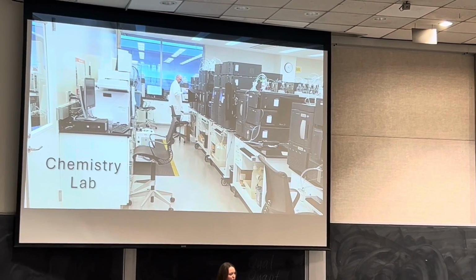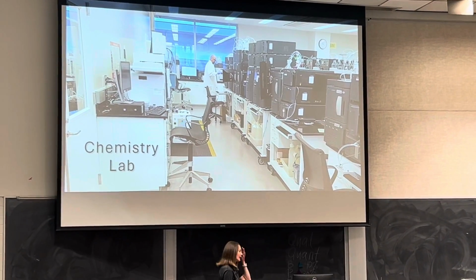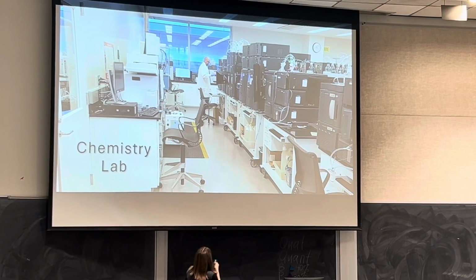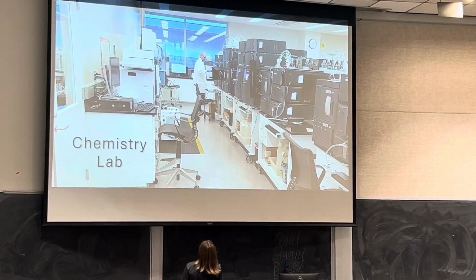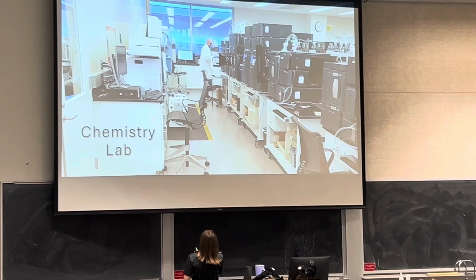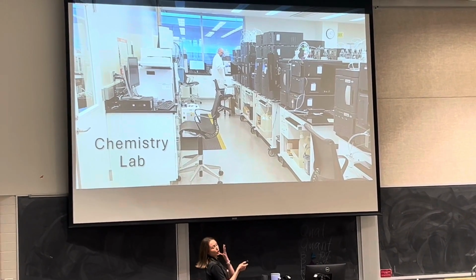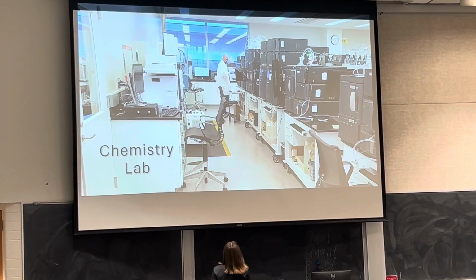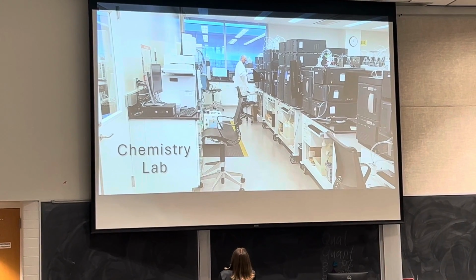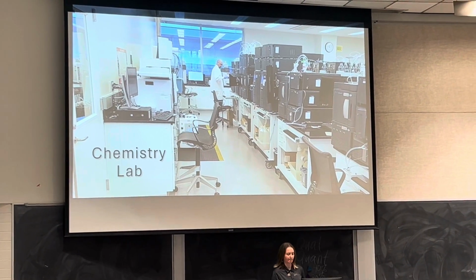Over here we have some more HPLCs and UPLCs, which are just HPLCs that can handle higher pressures. And then some more HPLC instruments for the dietary supplement testing. And then over here we have a GC gas chromatograph right here. the cooling effect when you suck on a cough drop. And then right next to it is used for testing various things, including your fatty acids in the fish oils.